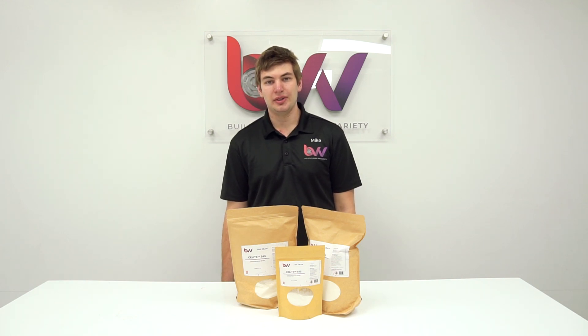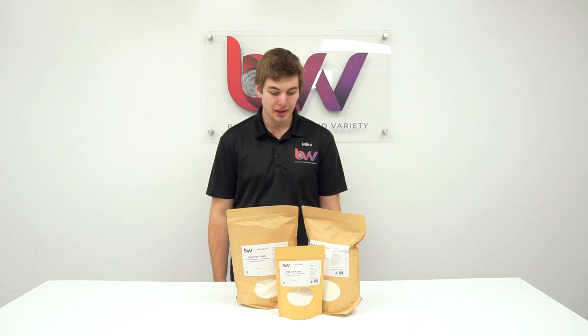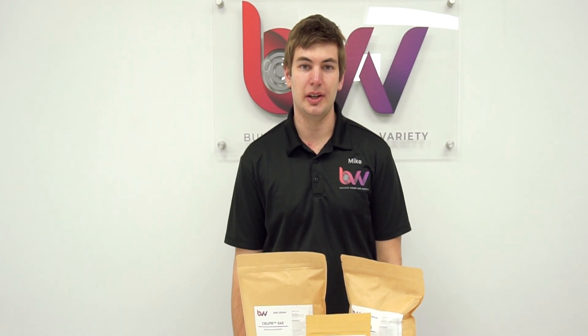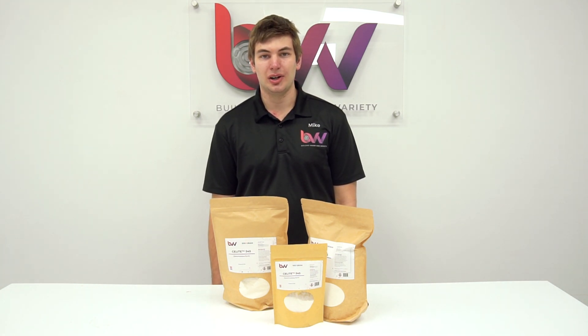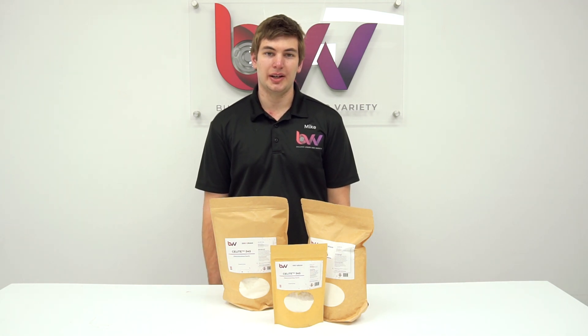You can actually use the diatomaceous earth to take out the activated carbon from your material before you perform any further distillation of it. You can see on here there is a little directions that says you can use this powder, make a quarter inch thick layer on top of your filter plate, and then you're going to use some kind of solvent like ethanol or hexane to just wet it and make a nice even patty.